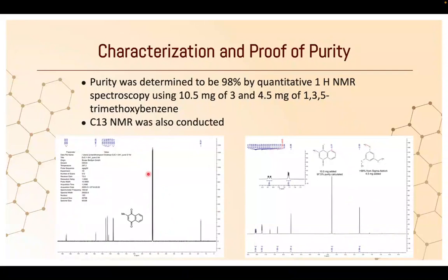In the notes section of the report, it was also mentioned that the product was determined to be light sensitive, and it's recommended that the product, specifically the solid form, be stored in the absence of light, and exposure of the compound to light should be minimized during the workup.